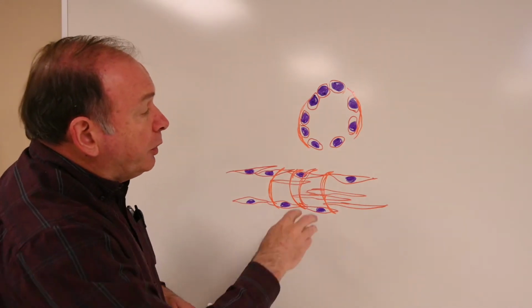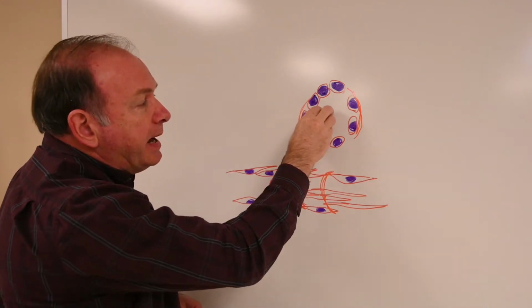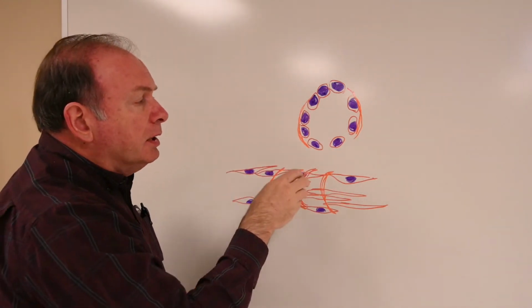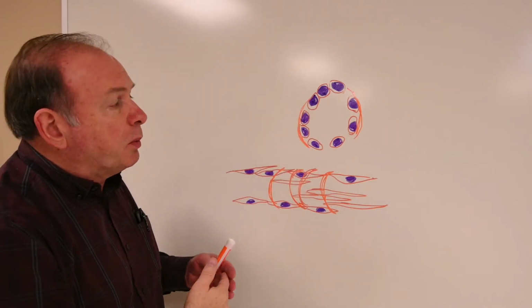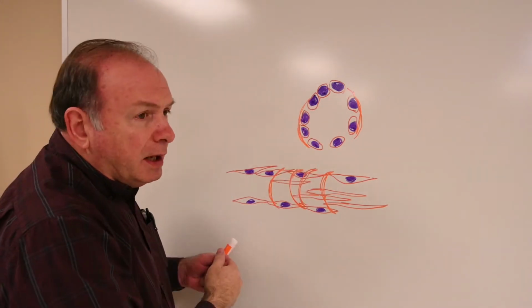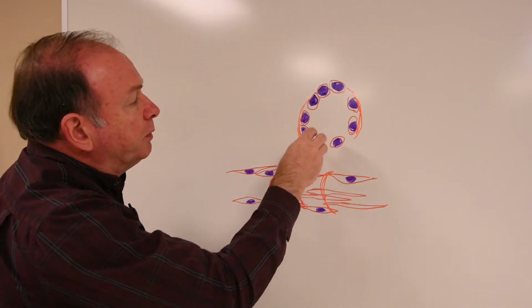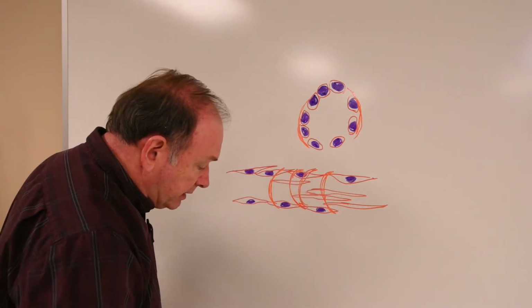So you would find red blood cells and white blood cells, lymphocytes and things passing through these splenic sinuses, mostly red blood cells. If you get a specimen under the microscope where the blood was pooled up in that specimen, you would have that full of red blood cells for the most part. If the organ had been drained of blood before the tissue samples were made, you would have an empty cavity or an empty space inside the splenic sinus.